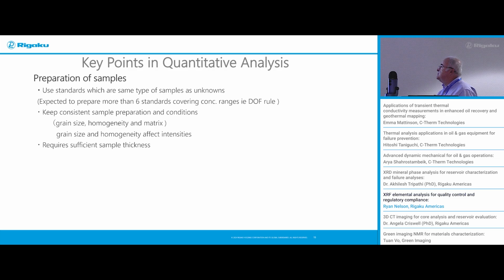So quantitative, standards. So you need, degrees of freedom always comes up. A lot of companies will use one standard, fit to the origin, which is incorrect, but they will. 3 standards, and even 5, but even with 5 standards, you really only can use slope and offset. You can't apply any corrections. When you get up to around 9 or 10 standards, there's enough math where you can apply maybe 2 or 3 corrections to it in an influence. And the people who wrote all the algorithms, et cetera, suggest 30 to 60 standards are ideal for very good math. So that's the typical calibration range.